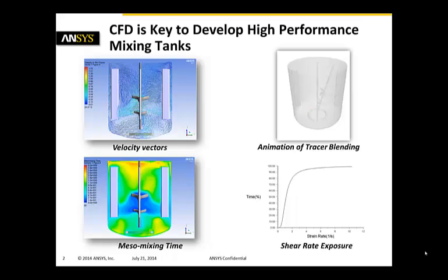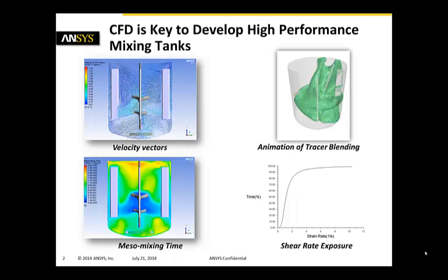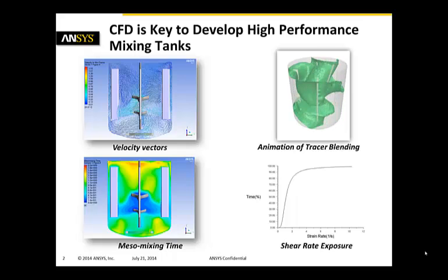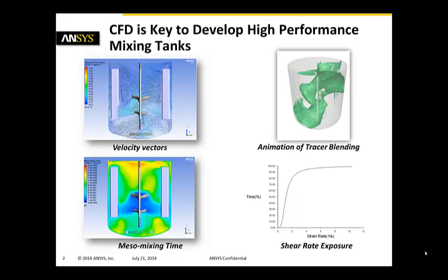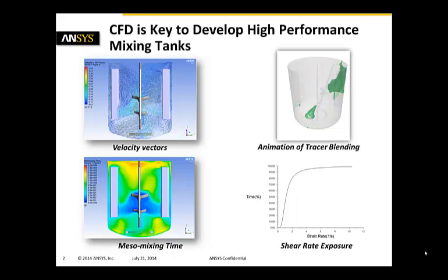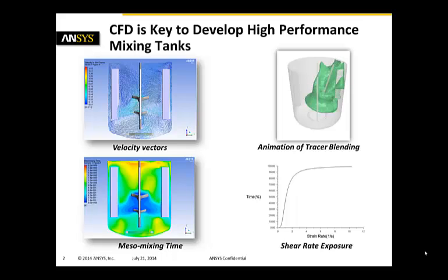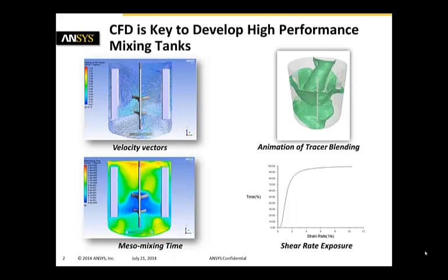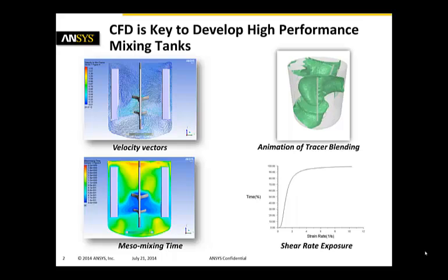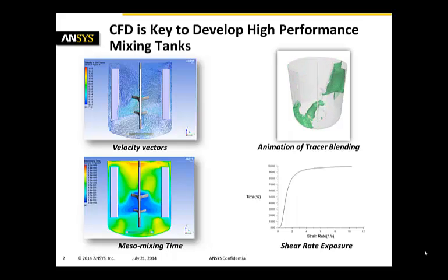If we look at the bottom left hand side corner, we can get information like meso mixing time. But we can also do analysis like looking at the animation of the tracer in blending simulation where we're looking at an isosurface of a tracer and how it gets mixed inside of the mixing tank.